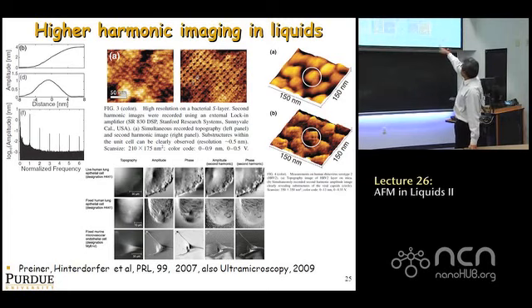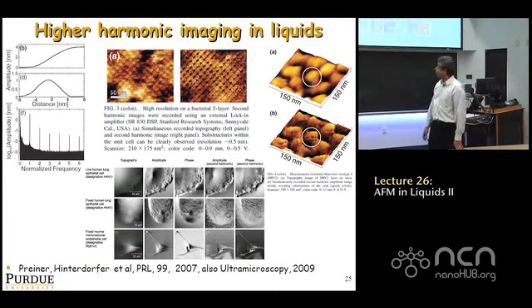You get phase contrast. The second harmonic gives you some contrast as well. What they found, interestingly, is it's when they looked at the fixed cell, which is the second row, that the second harmonic really started showing some very nice features, right? But when it comes to the live cell, if you look at the second harmonic image, you did see some contrast, but one can argue it's not any more or less than phase contrast. It's really not much more, right? But they really found that for fixed cells, you could pick up a lot of interesting features with it.